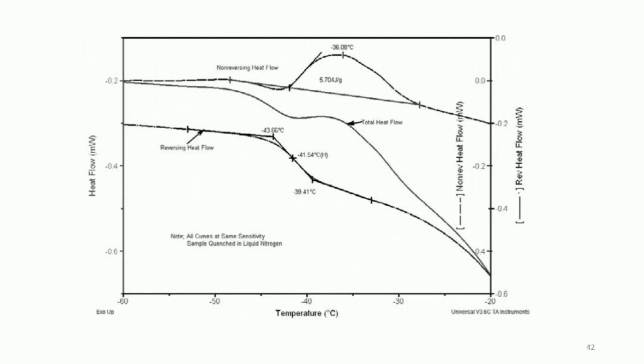In general, it provides the following advantages over traditional differential scanning calorimetry.